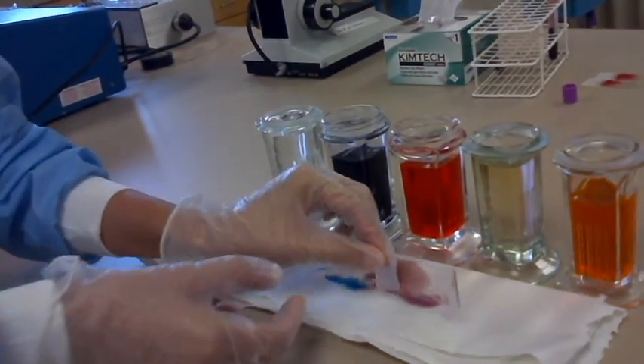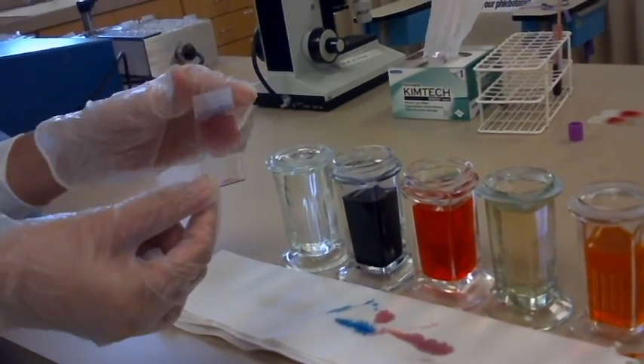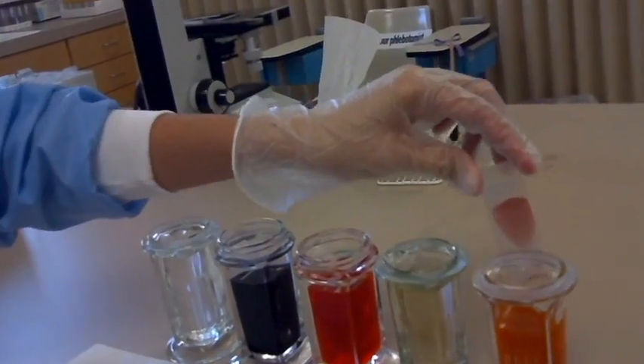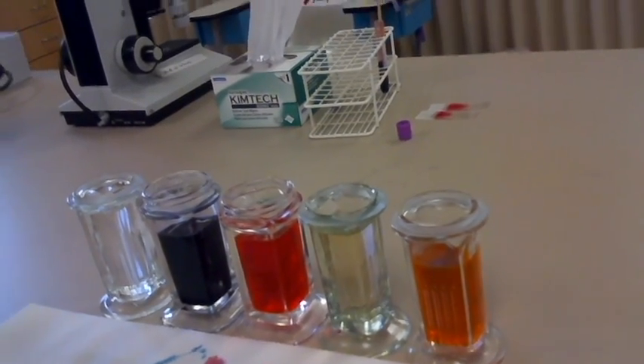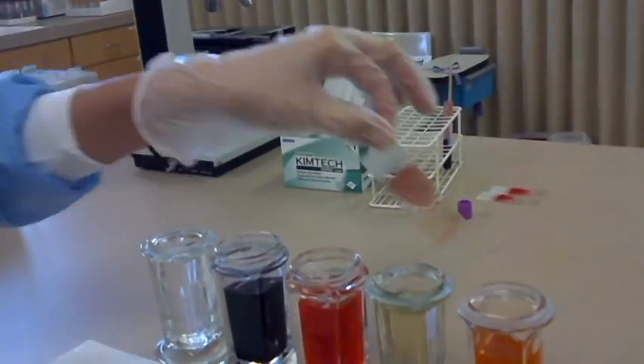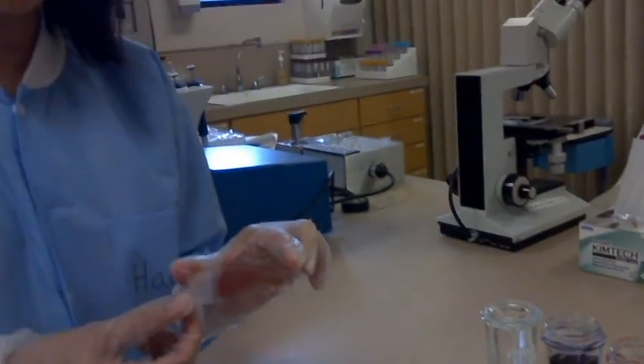Then I tap on both sides again. After that, I put my smear in buffer for 1 minute. Buffer is really important because it helps the cellular structures take up the dye. After 1 minute, I take out my smear and tap on both sides again. Now you will use the microscope to look at your smear and differentiate the 5 types of white blood cells. Thank you.